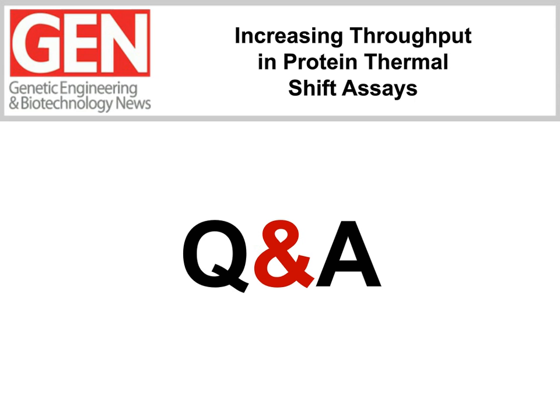Okay. Someone would like to know, how many data points are you recording per degree C? That is exactly the question that actually relates back to the resolution. Typically, for example, let's say that you are doing the screen for the first time, and you are just trying to understand what is the TM of your protein of interest after it binds to the ligand. So you ascertain that value. To do that, I would say just start off with probably 10 or 15 acquisitions per degree. Then you will have the full range of your melting curve right there in front of you.